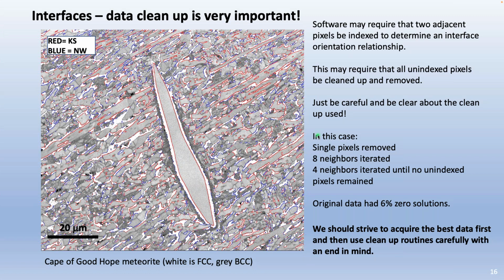If we are unclear, if we just present this map without telling people what we did, I think that's bordering on at least carelessness on the user's part. And again, I think the important thing to take away is we should always strive to acquire the best data first, and then use our cleanup routines carefully with an end in mind.